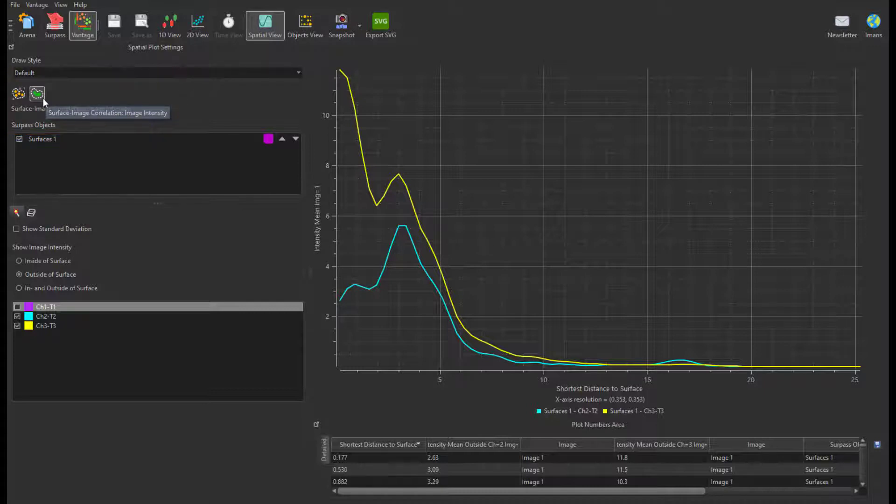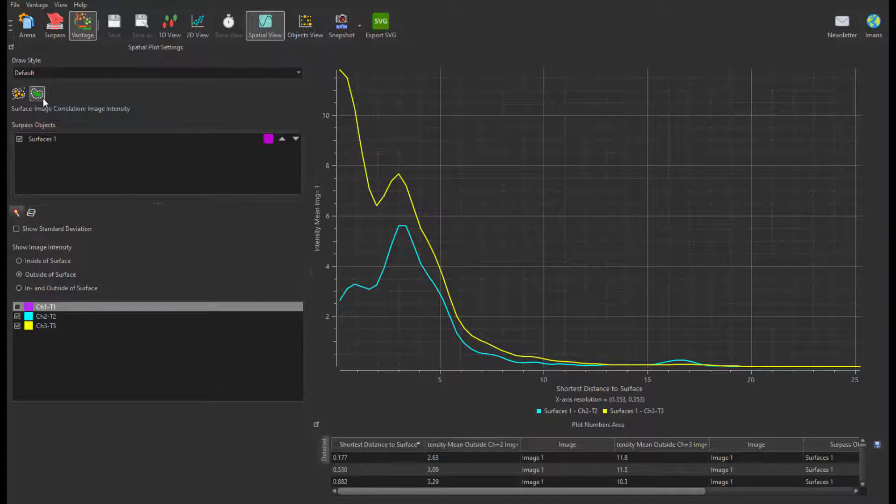It displays a 3D mean intensity plot of each channel within the image around the selected surface.